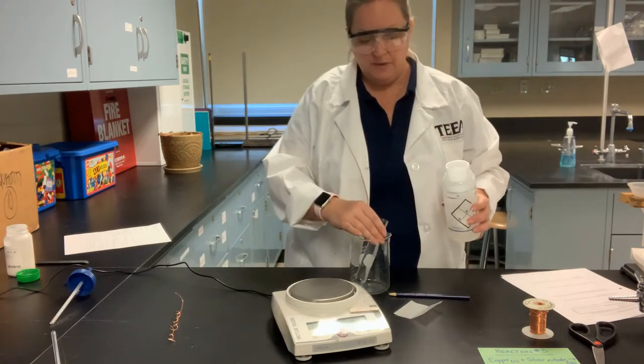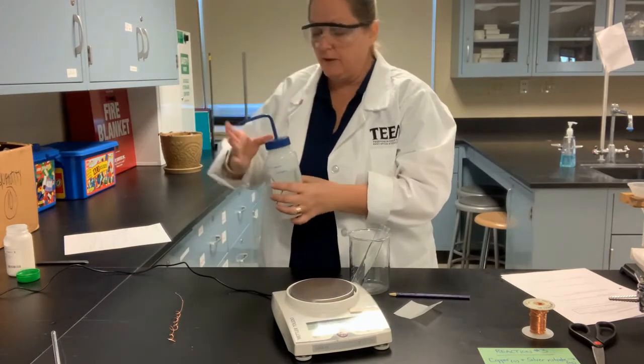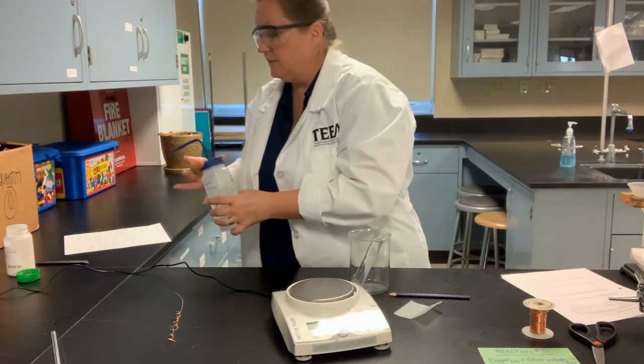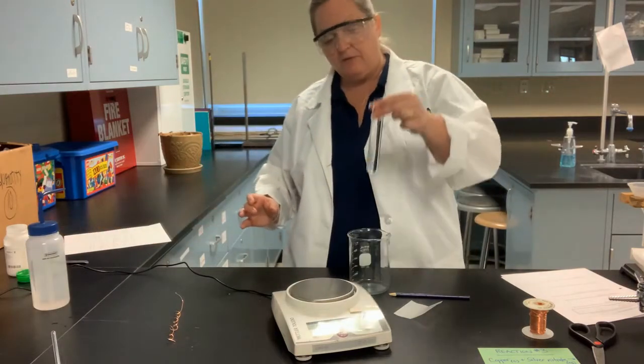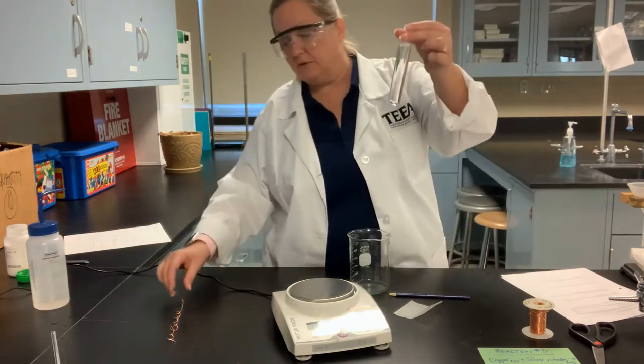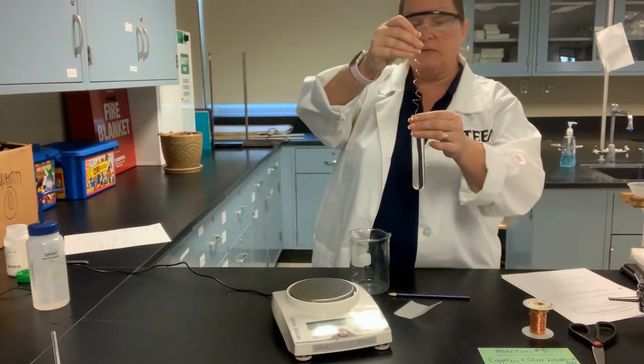There we go. So I filled my test tube about 3/4 of the way full with water. And so now it contains the 0.33 grams of silver nitrate and about 3/4 of the way with water. My silver nitrate has dissolved. I don't even need to stir it. It's highly soluble in water.